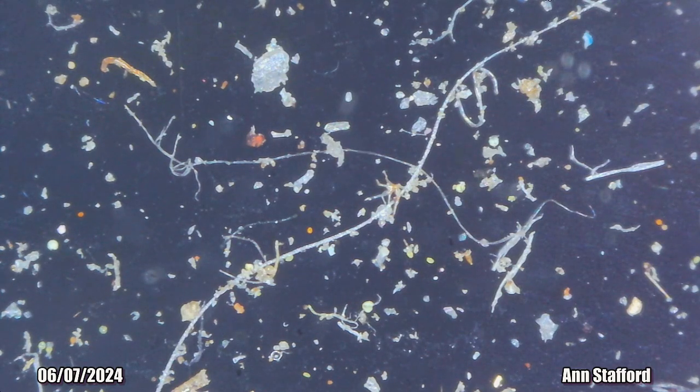All I can do is kind of monitor it, so I should probably record where this is at. I think my wind chimes have gone crazy. Let me pause. Okay. I've tried to mark, I put marks on the electrical tape which holds the glass down, to try to line the microscope back up with those marks so that I can monitor this. That's about the best I can do with this particular.